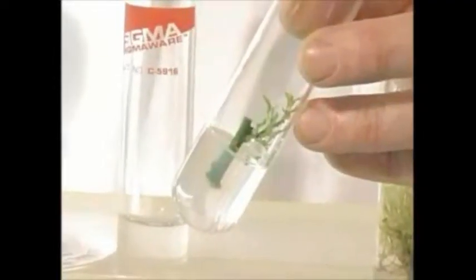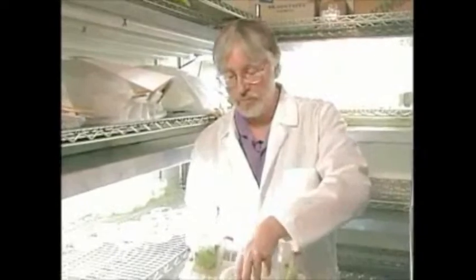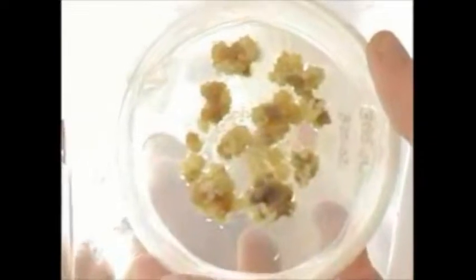So I'd like to show you two different micropropagation systems. One is organ culture, and the other is somatic embryogenesis. Organ culture depends on proliferating shoots in culture and then using hormones to induce adventitious root formation. So basically we're dealing with cuttings at the end of the process, but they're micro cuttings. Somatic embryogenesis is a variation on the theme we considered earlier of asexual embryo formation. So let's go over to the sterile work area and take a look at it.